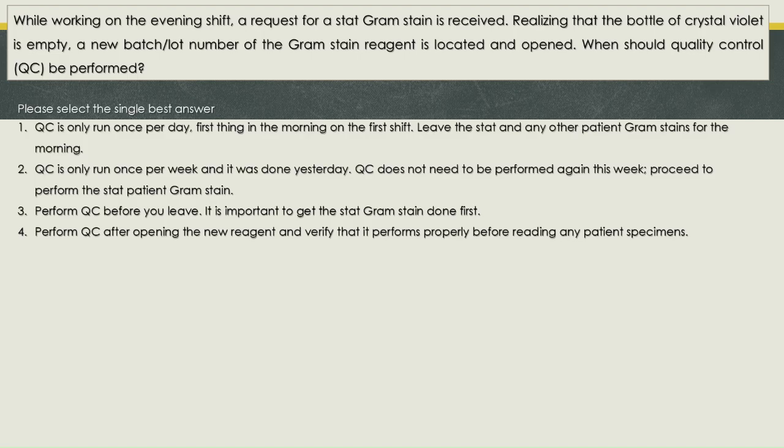1. QC is only run once per day, first thing in the morning on the first shift. Leave the stat and any other patient gram stains for the morning. 2. QC is only run once per week and it was done yesterday. QC does not need to be performed again this week. Proceed to perform the stat patient gram stain. 3. Perform QC before you leave. It is important to get the stat gram stain done first. 4. Perform QC after opening the new reagent and verify that it performs properly before reading any patient specimens.